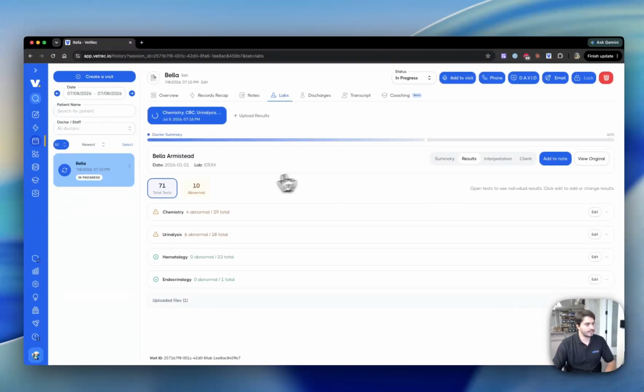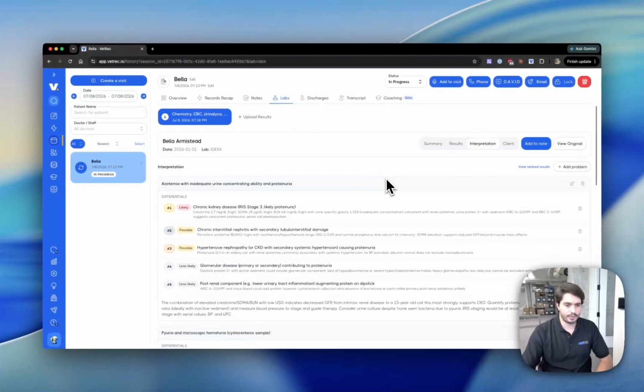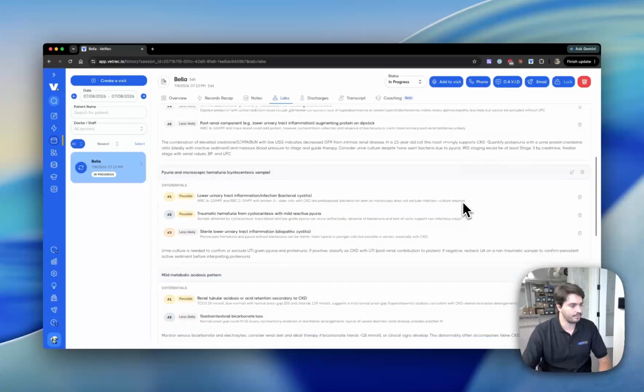In addition, as I said, to the results, we'll then generate an interpretation report. These reports are meant to be a guiding step of what the case is showing based on all the information provided, and they can always be edited. So you can always delete things or move things around depending on what you want the report to say.